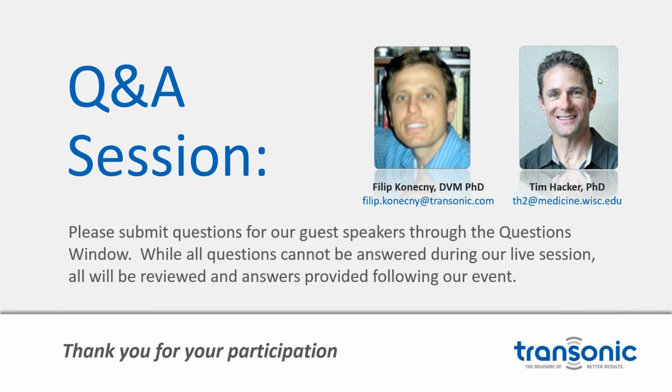Yeah. Sure. Okay, let's switch gears. Bruce asks about the use of fluoro and whether it is essential in PV science for catheter placement. Tim, you talked about your approach. You mentioned X-ray helping you, but you also mentioned that you're reliant on the phase signal as an indication of catheter location. So, specifically the question is, do I really need fluoro? Is it essential for proper placement? What's your take, Tim, based on your experience for LV and RV, frankly?